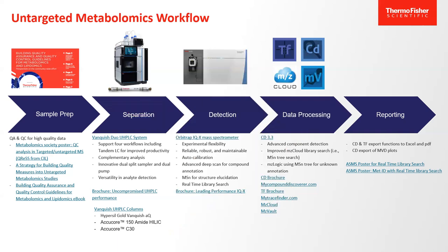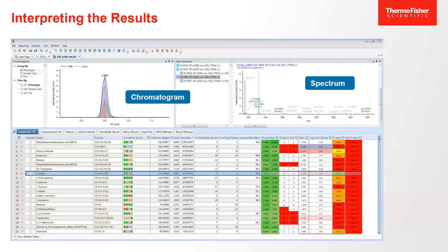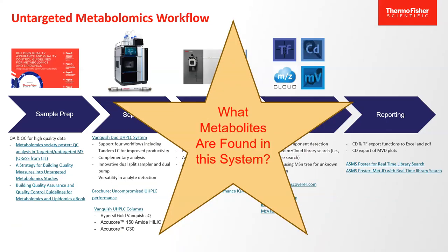Now, I want this clear. This is about, that was painful. This is about 10 times harder than doing targeted metabolomics. Okay. The software runs just as easily, the results come up. But you're going to spend more time asking, is this the correct result? Because you have to judge the confidence of your identification, which has already been done in a targeted experiment. And that's where the difficulty comes and you slow down.